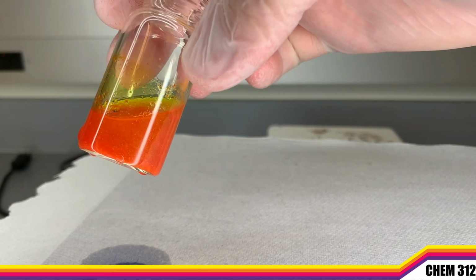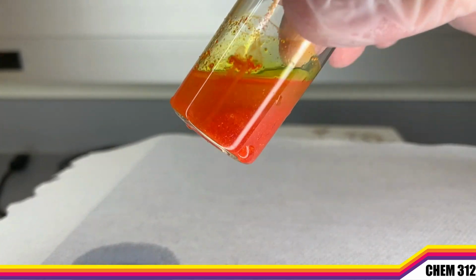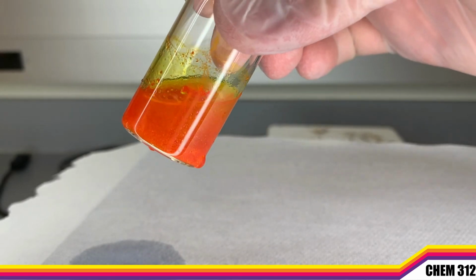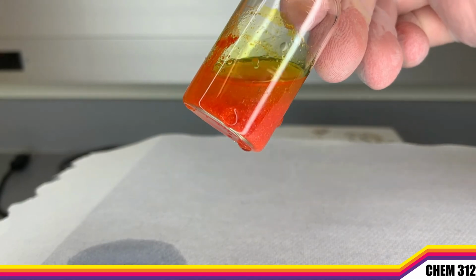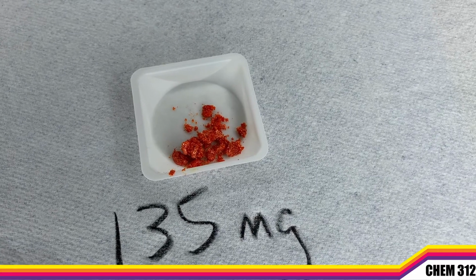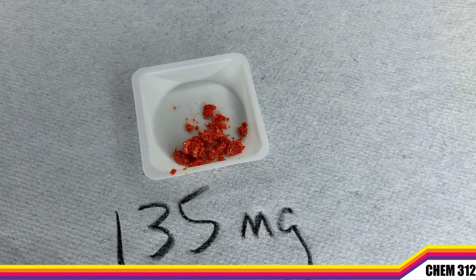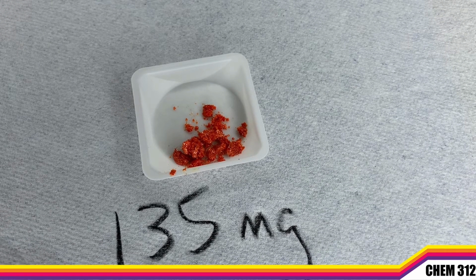I gave it a little bit of extra time in an ice bath to fully crystallize, and we're able to see lots of nice big orange powdery chunks in there. It looks like orange glittery sand. Let's filter this and see how much solid we were able to isolate. Here's our crystallized imine product. We were able to get 135 milligrams out. You'll need this number to calculate the percent yield of this chemical reaction.